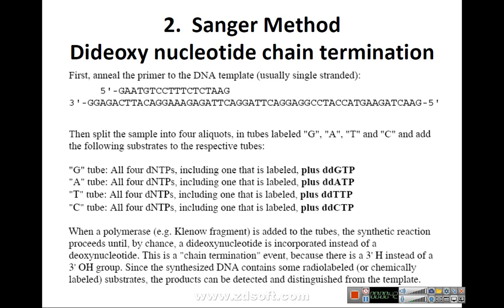Dideoxynucleotide chain termination method. First, anneal the primer to the DNA template, usually single stranded. So let me explain it, then we will go for the reading because there is a lot of reading.